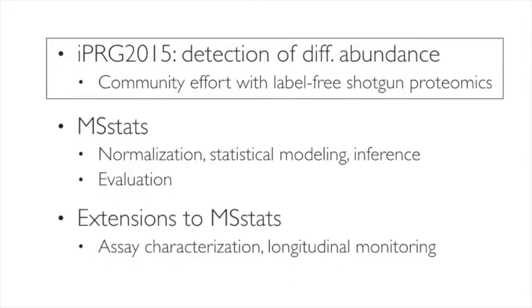But what I would like to do, and I apologize for the redundancy, is to tell you first about the IPRG data set. Oh, I don't have the mouse here. Okay, we'll just have to hand wave, I guess. So we heard about this already, but this is the data set that we will be using for hands-on exercises. And I want to make sure that those who join us right now know what's going on, okay? And then we will talk about MSstats.